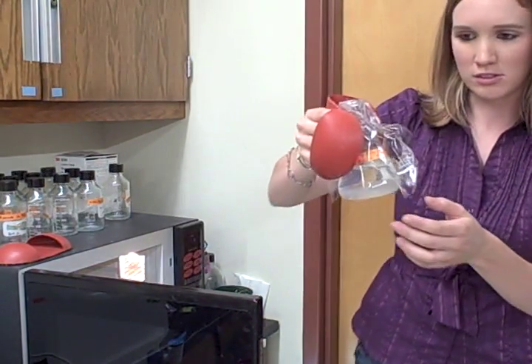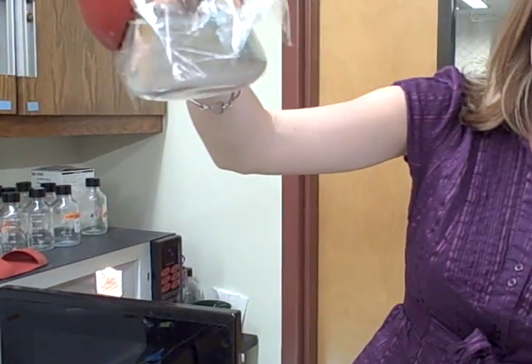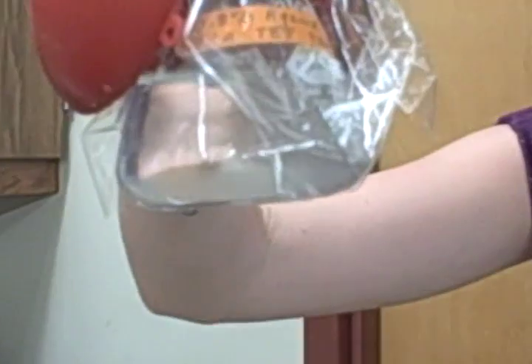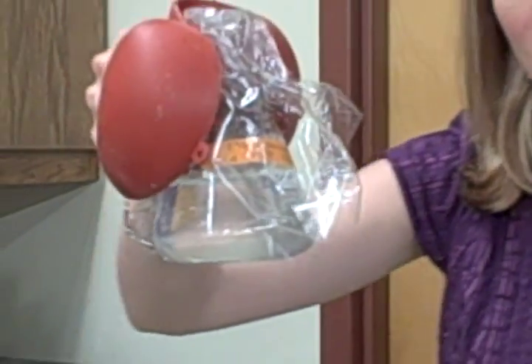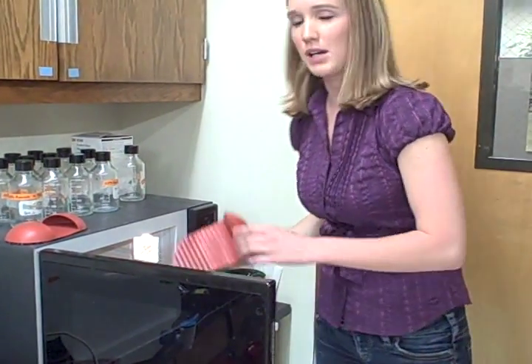Here's the solution. You can see that it's not completely dissolved yet — there's still a lot of particles at the bottom there. So we're going to go ahead and put it in for another 30 seconds and it should be pretty much melted by then.